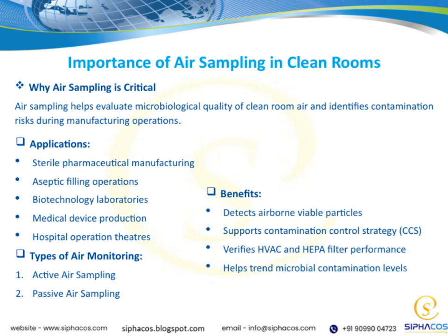There are different types of air monitoring methods. Active air sampling, where we actively draw air through a device to collect particles, and passive air sampling, which involves simple settling plates left out to detect particles that settle by gravity. Both are valuable tools in our contamination control strategies.